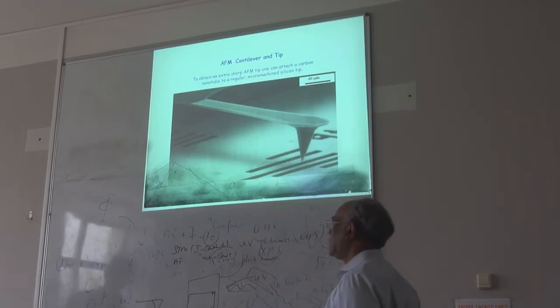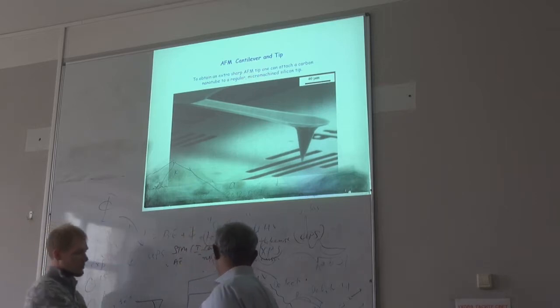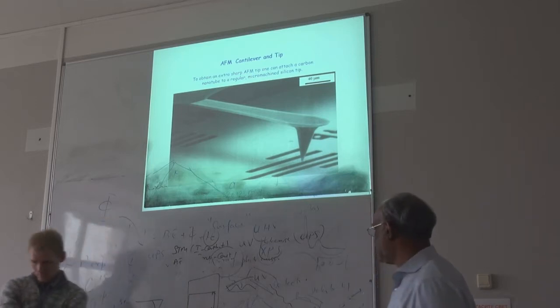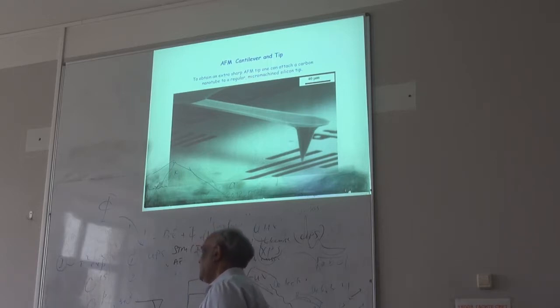And what is the typical scan area? In the one we have, we can do about 20 or maybe 30 micrometers by 30 micrometers. It's big if you are working with the nano. Yeah, we don't need that much. But typically, if you want to get this height, we like to get the height from both ends, this one and this one, then it's more accurate, right? Not from one end. That's how we use it.